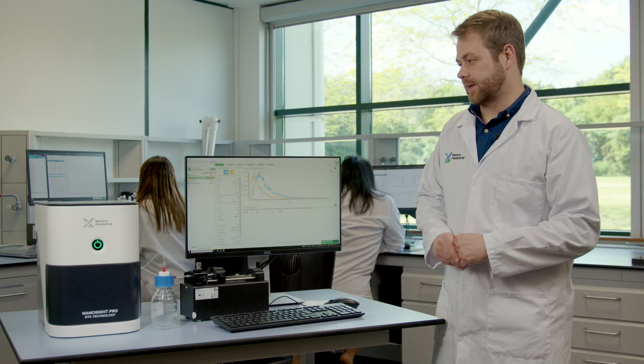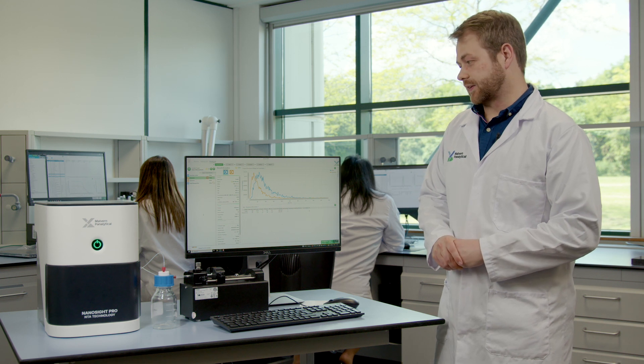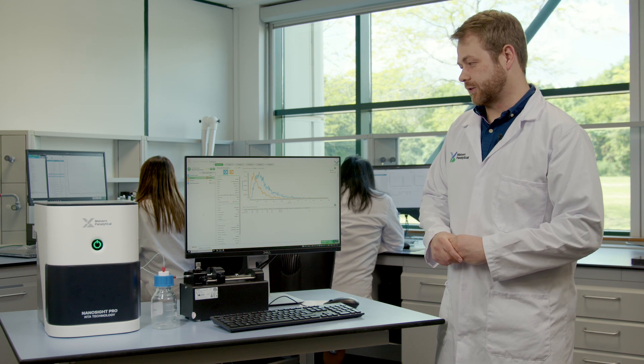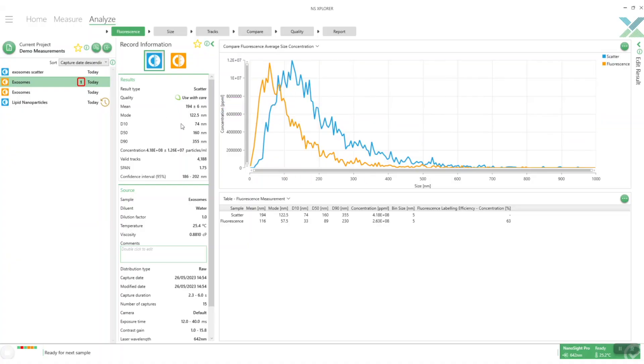Once our measurement is finished processing in the analyze page we can quickly see what our results are. Here we've got our exosome measurement we did earlier and we've got an overlay of the two results, the scatter part and the fluorescence part and you can compare those two distributions straight away. We've also got a fluorescence efficiency value which gives you a good idea of the ratio between those two measurements. We can also look at other things separately so what the size values are such as the mode and mean for each one.